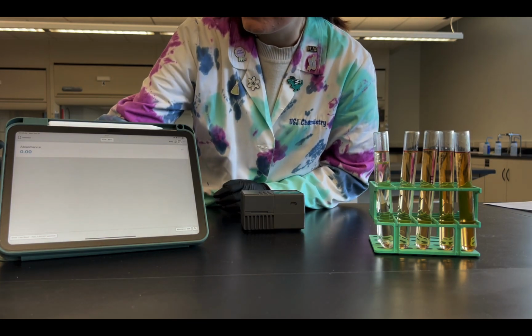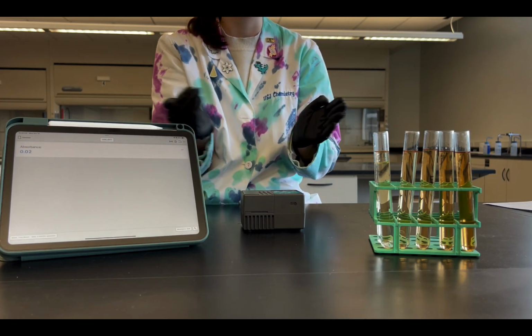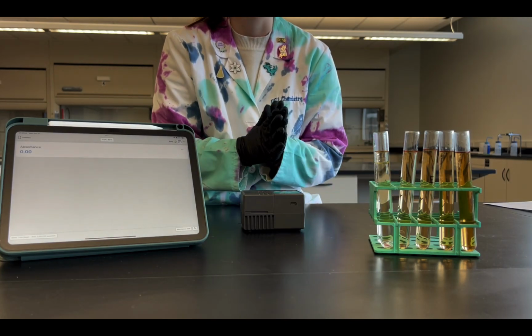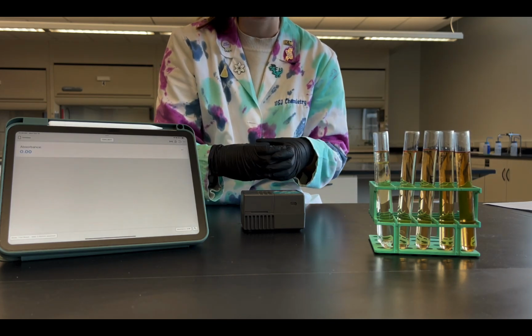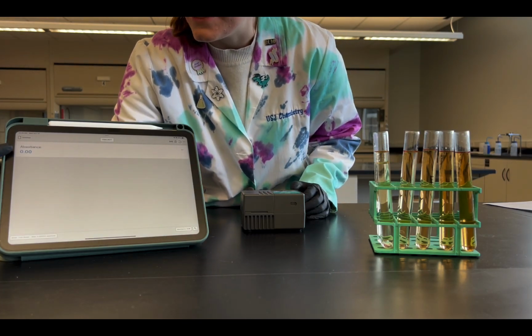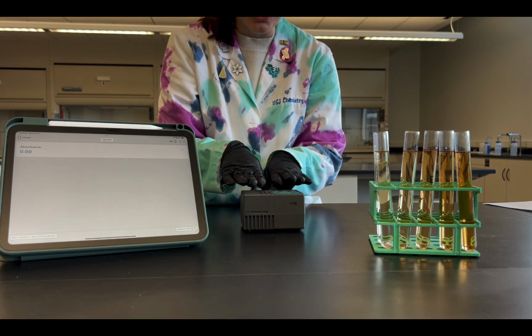Now, as we can see, the absorbance is starting to go up and down. What it's basically saying is I'm passing some light through this solution, and I'm absorbing this much. I'm now going to subtract that off and say, I don't need this. It's almost like when we're on a balance and we want to tare out or cancel out the mass of, say, the weigh boat or weigh paper that we're putting our solid on. Now that the calibration's done, my absorbance is reading as 0. It's basically saying that this color is now zeroed out, and the colorimeter is no longer going to read it.